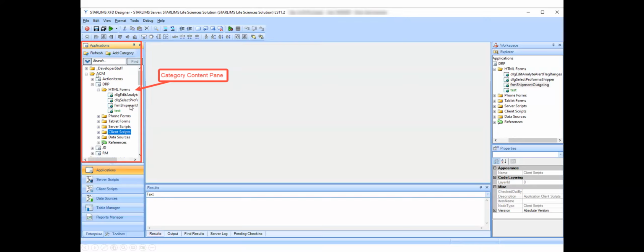And then you add, once you've opened the application, which appears over on the right-hand side over here, this example shows DRP. I opened this application and it appears over in the Explorer. So now we can see my forms and the other types of categories that occur within an application. These are the actual forms that I've created within this test application.